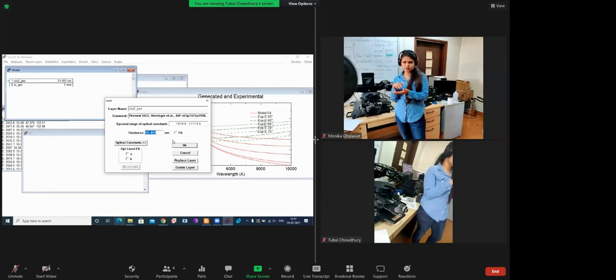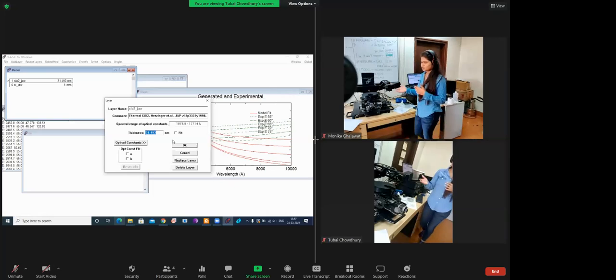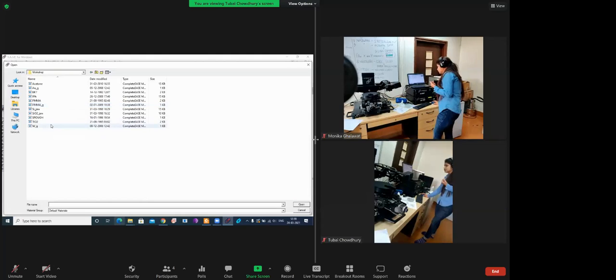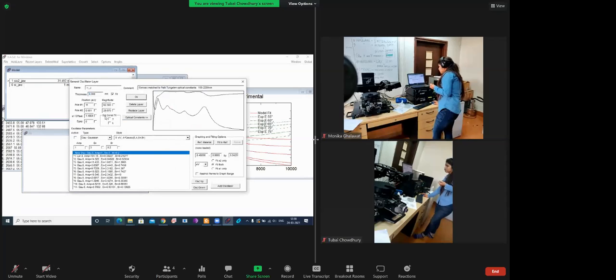Your coated thin film. So here I am just assuming it's 31, and I know it's not correct because whatever information I'm getting is after the tungsten. Since I have not made this, right now we don't have a reference, but it's preferable to go for your reference wafer. Always, it will be better for you. So again, we will add a layer, and now I will use the tungsten model and go for fit. We'll go for N and K also.